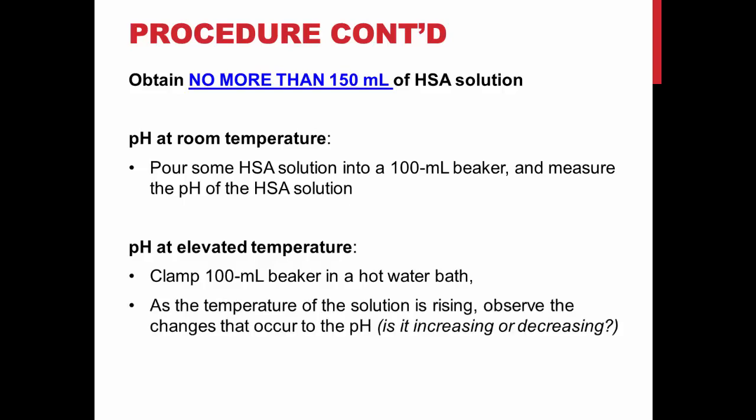When the temperature stops increasing, which should be at the temperature of around 40 degrees Celsius, record the pH and temperature of the solution.